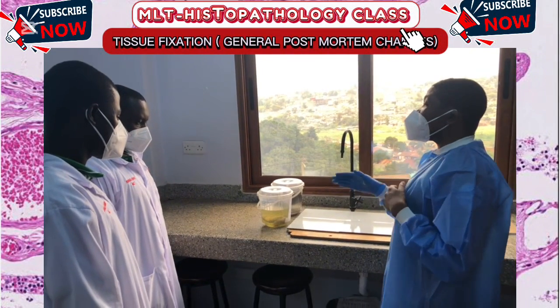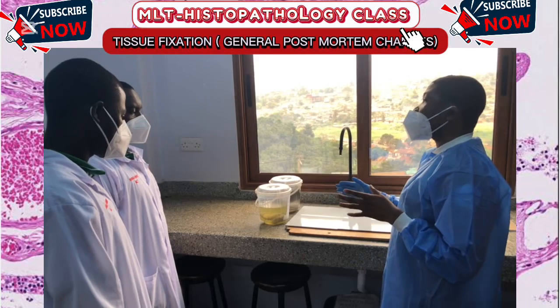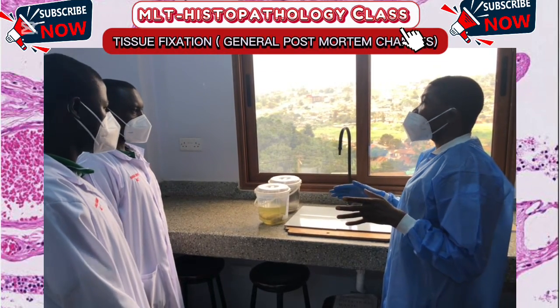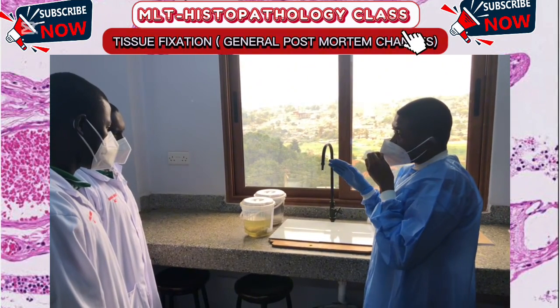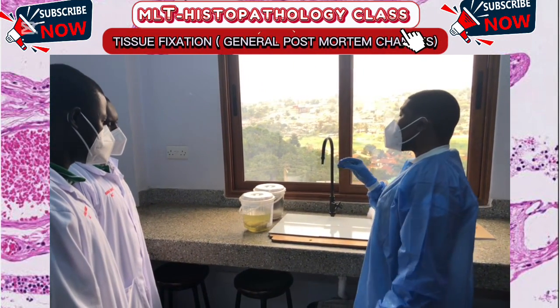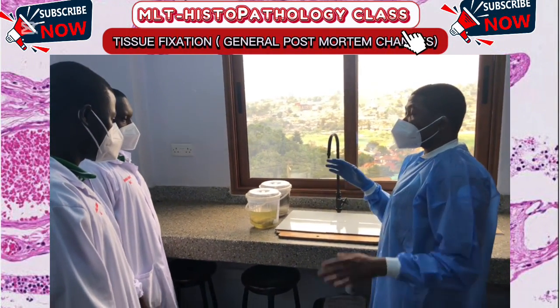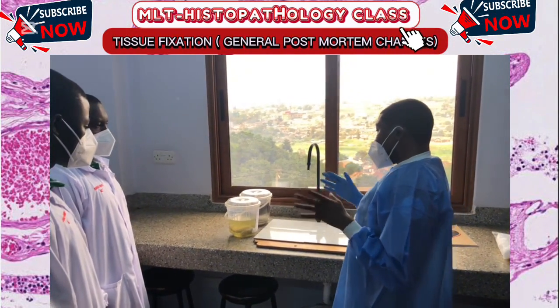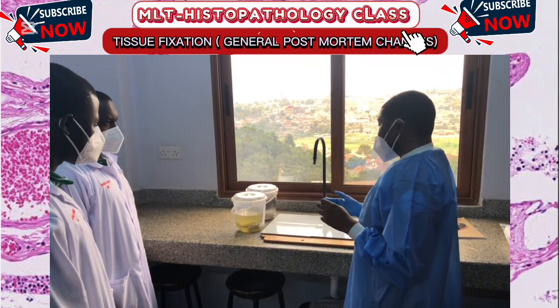So usually there are changes that occur after death, and that's what we call post-mortem changes. Fixation is aimed at stabilizing the structure and the chemical composition of cells or tissues, making them suitable for microscopic examination and long-term storage.